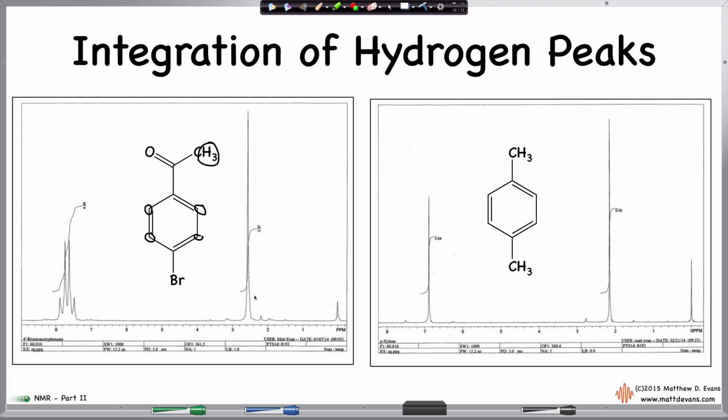Now, why is it that we only see 2 signals here? Well, this is the methyl group, but it's because these two signals here and here are just so close together in the spectrum that they just appear to overlap in this region right here, and that's why we can't really tell the difference between the two. And also this pattern right here is called a complex pattern. We'll get into that in part 3. But nonetheless, both these signals are represented by this total peak. That's also why I integrated this as one giant lump sum, even though there's two types of hydrogen represented by this.